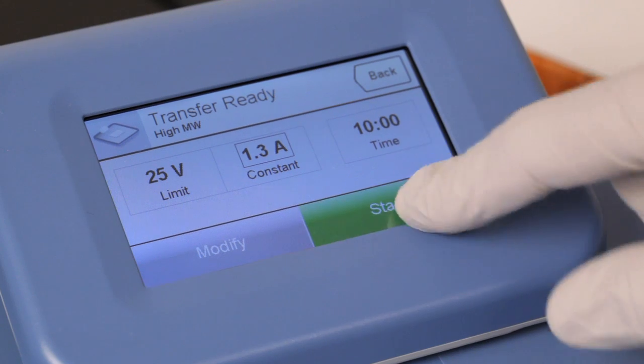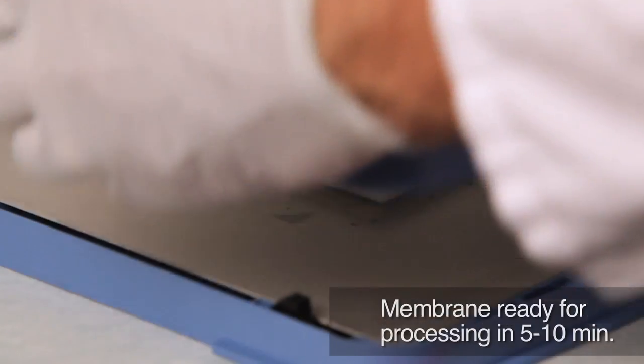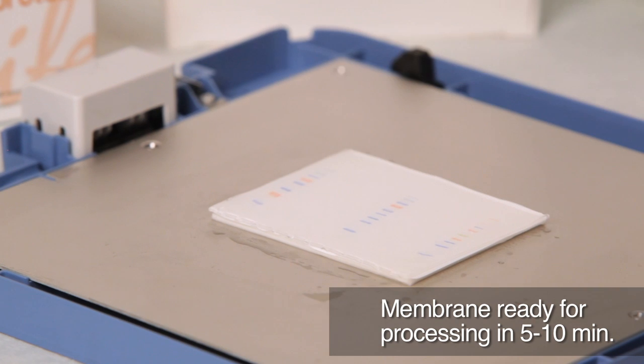After selecting or creating a method, simply press Start to begin the transfer. When completed, the membrane is ready for downstream processing.